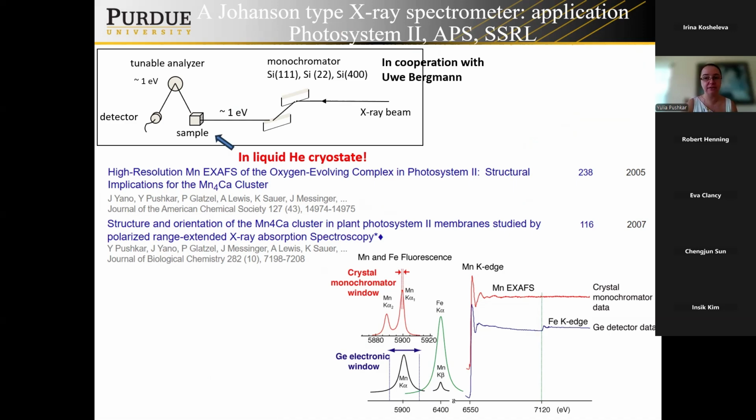We came with thousands of protein samples, very thinly filled because the penetration depth is about 0.5 millimeter. So concentrated, thinly filled samples in the sample holders. They were loaded into the liquid helium cryostat and shot point by point with the focused X-ray beam, maybe under 1 second exposure per point. That's why so many samples. This is just a tiny cartoon here, but the spectrometer array was a monstrosity and took several days just to set up and align all those spherically bent crystals.